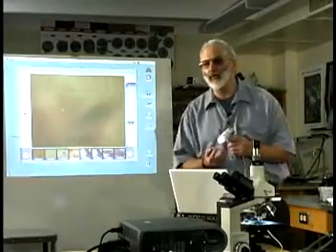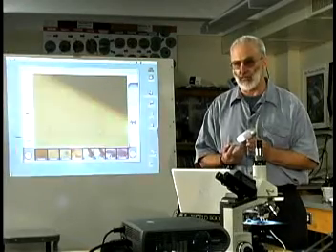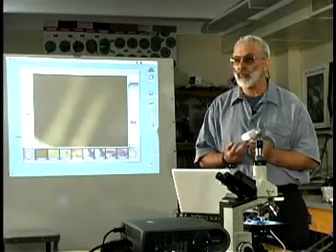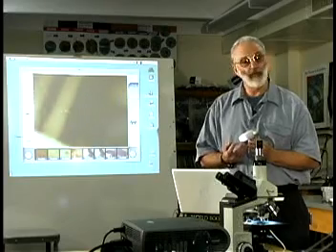Today we're going to be working with marine sedimentation. We're going to be looking at different sources of sediment from 3 different beaches. We're going to look at a sample from Newport, California. We're going to look at a sample from Newport, Oregon. And we're going to look at a sample from Bermuda Island.